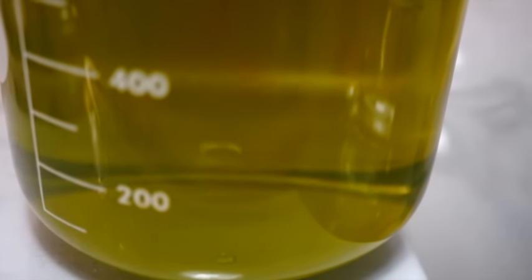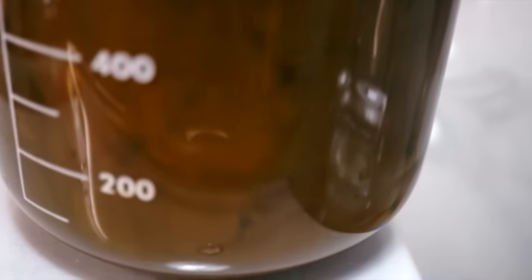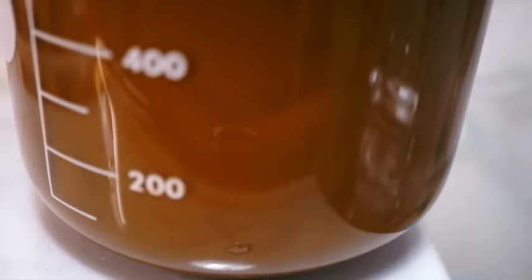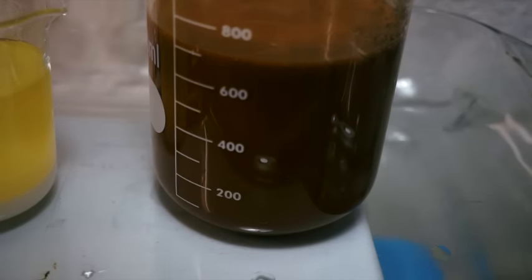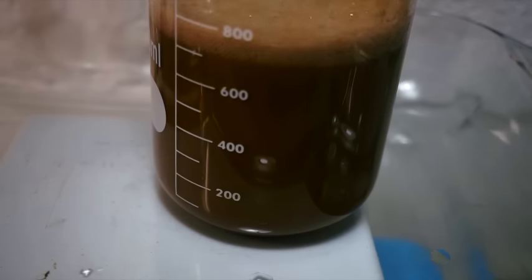What's happening here is the sodium metabisulfite is reacting with the hydrochloric acid to produce sulfur dioxide gas. The sulfur atoms attract the gold atoms like a magnet to iron, and as the gold atoms crowd around the sulfur atoms, they fuse together and drop out of solution as a metallic powder.